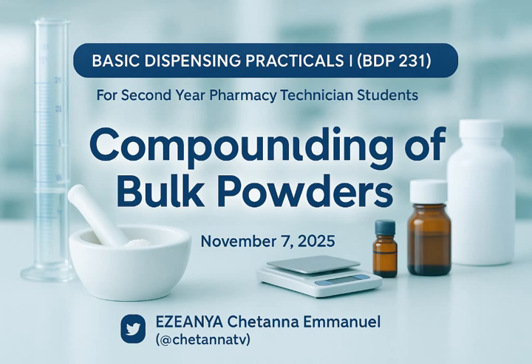Please, this label should be in red. Any additional label that has to do with warning, if it is talking about anything external, use red pen. Don't use blue or black pen. For external use only, you write the title of your preparation, the quantity. Then there are two types of preparations.